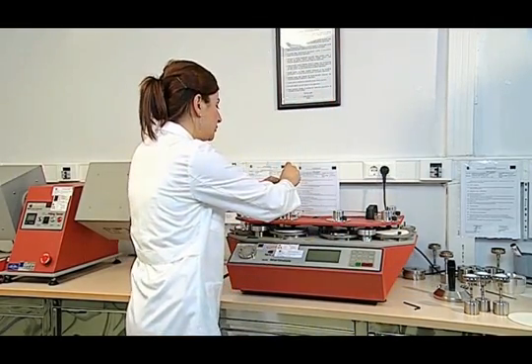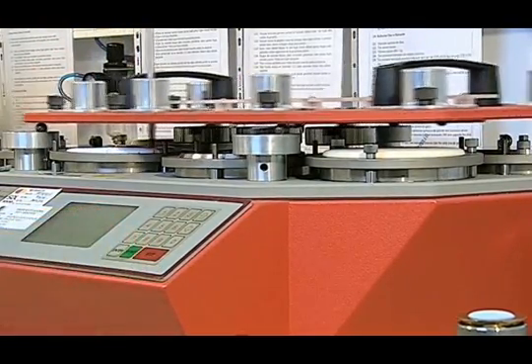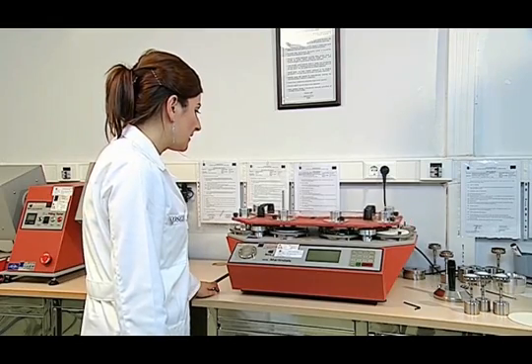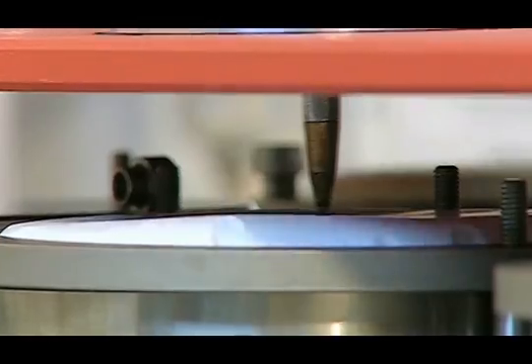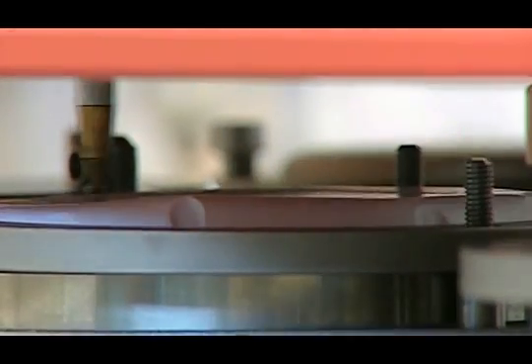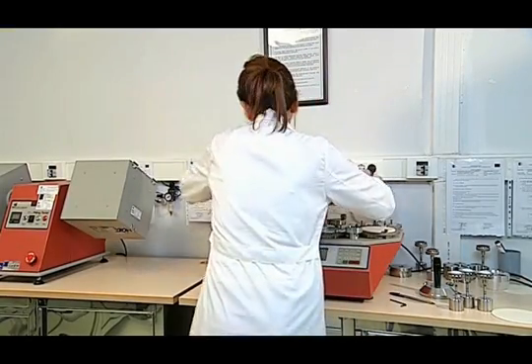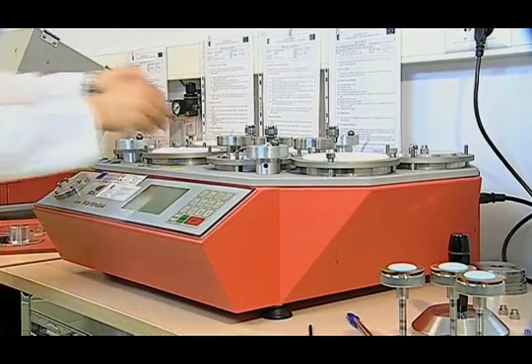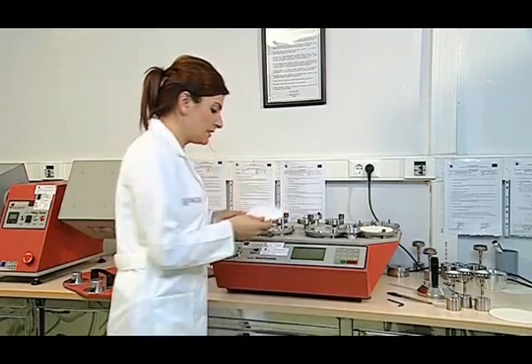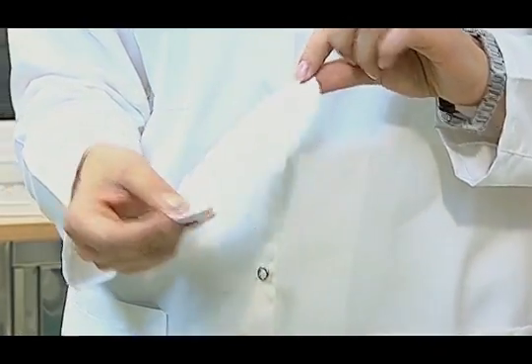A pencil is placed in the sample holder of the table which we will check. We begin to check by pressing the start button. After the device has stopped, the pencil is removed from the slot and the pattern is checked. This process is repeated separately for each table. Pattern ranges are checked, and when pattern intervals are equal, we accept that the device is suitable.